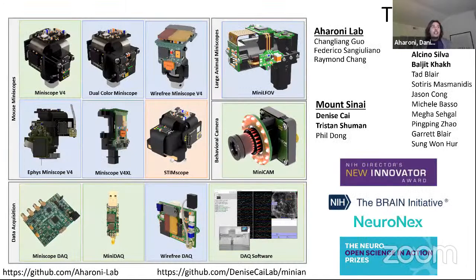But I think it is somewhat of an open question, and something people are working on, how, in the end, building Miniscopes, labs are sort of worried about taking an assembly kit and putting lenses in it and working with a circuit board. That ends up being pretty easy. Labs then are really concerned with how you actually do the surgeries, but most labs have worked with animals, done maybe ephys surgeries or other optical implant surgeries. That ends up working fine. You then have to get the animal to perform behaviors and stream data, which labs also seem to get over without too much of a problem.